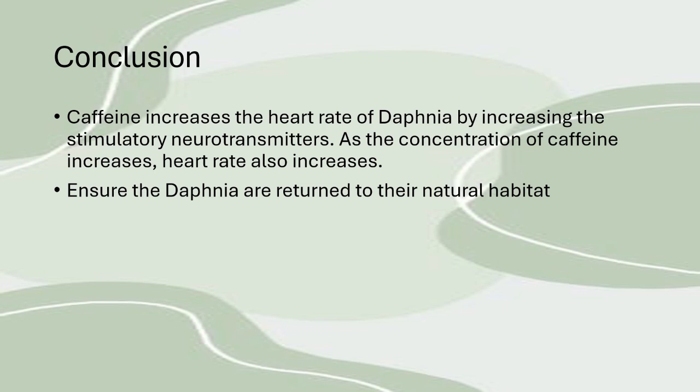One thing I would suggest to improve this practical is, after you finish immersing the Daphnia in a particular concentration of caffeine, return it back to its environment and then start again. That way the Daphnia is not overstimulated and it's not put under pressure or pain, because once again, this comes under the ethical side of using Daphnia in this practical. And of course, finally, after the practical, ensure the Daphnia is returned to its natural habitat.